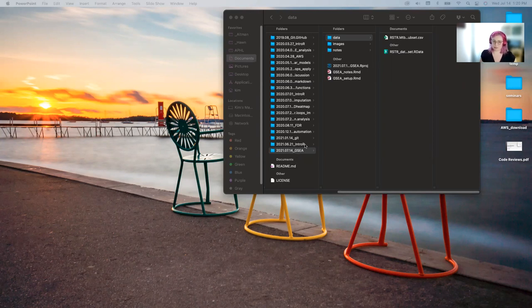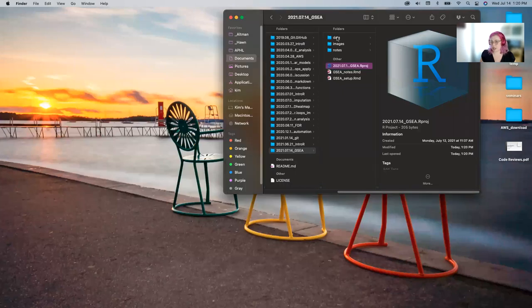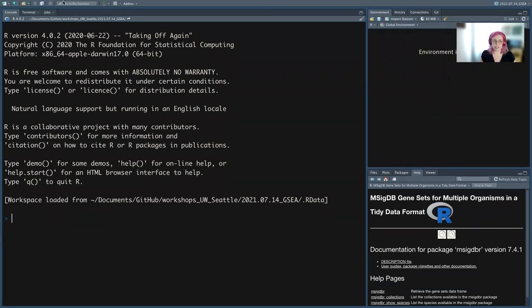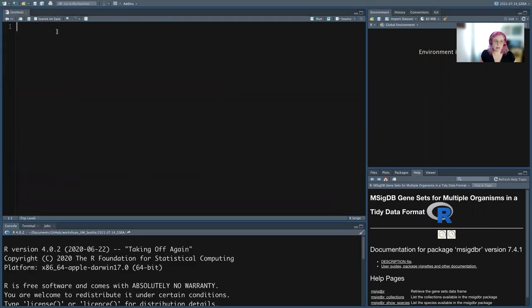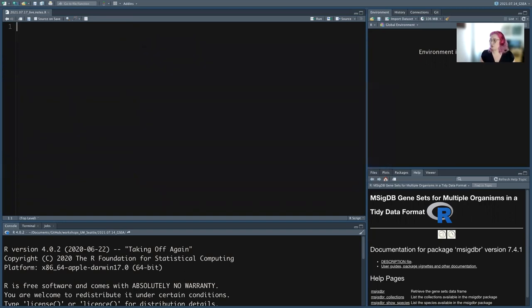So now we're going to run that in R, and then we'll go back to talk about GSEA background. You should have the full folder — it's also on GitHub. I'm going to open the project. Everything I do is in the project. If you're starting from scratch, make sure your data are in a folder named 'data', or modify the code to remove the data folder name. Here we have our lovely RStudio. We're going to make an R script where I'm going to live code pretty much everything in the notes. I'll upload this to GitHub as well.